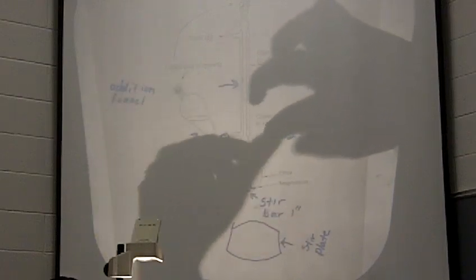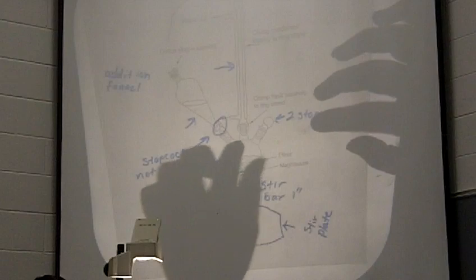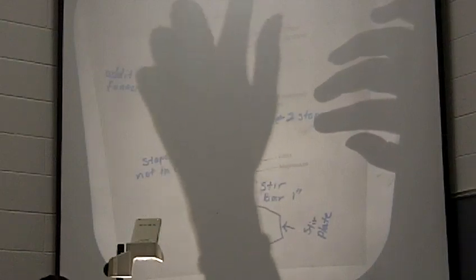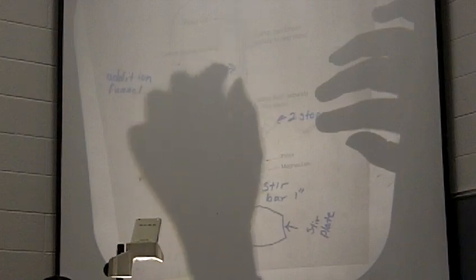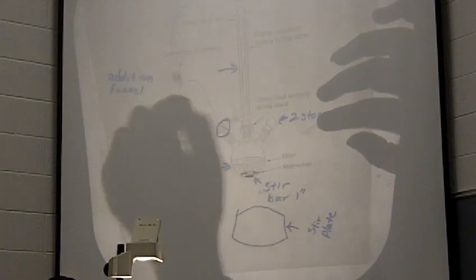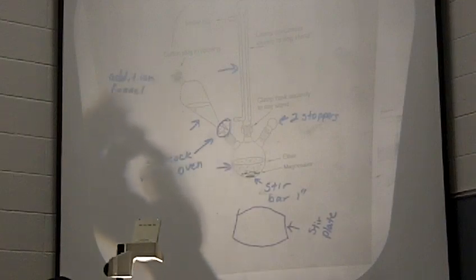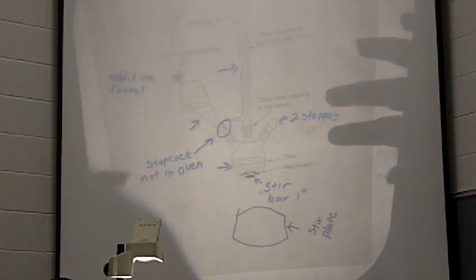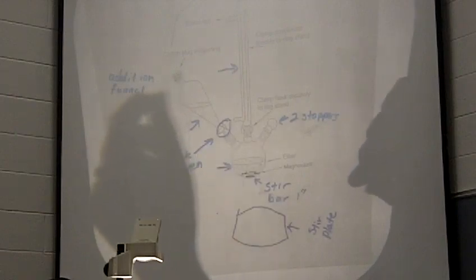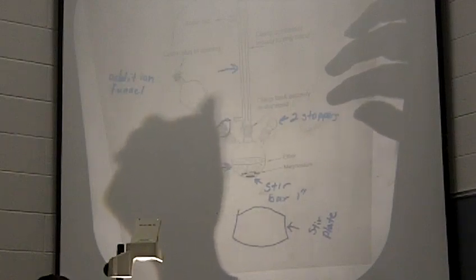So as you put this together, you'll have to pull some of the cotton out to put your addition funnel and your condenser in. So you're going to want to clamp your round bottom flask, then your condenser is going to go in the middle joint, okay? And you'll clamp it just like you do a reflux condenser, so you want it nice and vertical. Then you're going to have your funnel over on the side, and it doesn't matter which side. I would put it on the side of whichever hand you are, okay? So if you're right-handed, put it on the right. If you're left-handed, put it on the left, because it'll be easier to manipulate it that way, all right? And you want to put all your Teflon pieces back in there, okay?